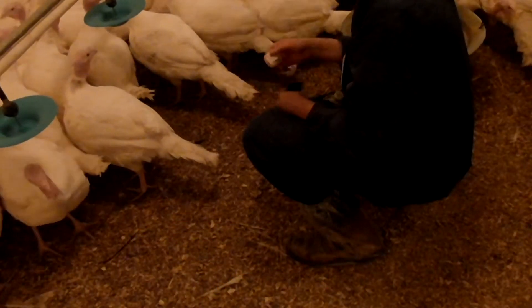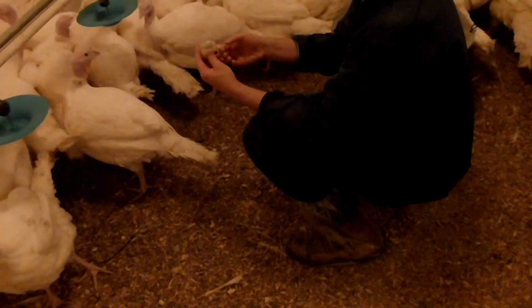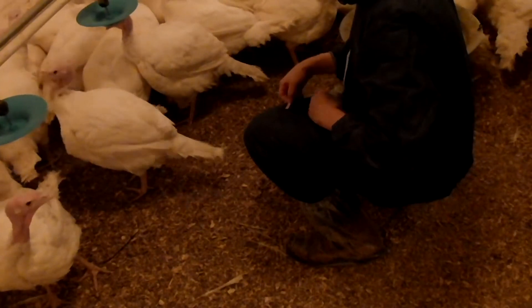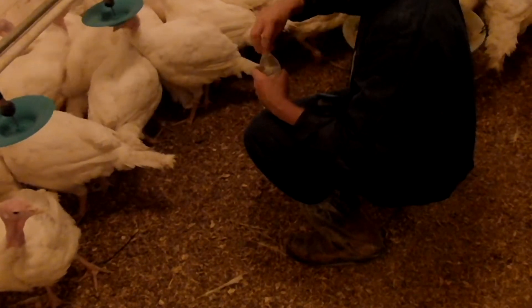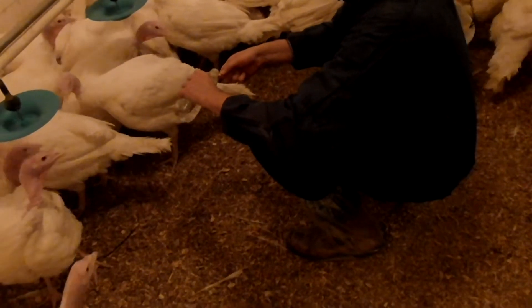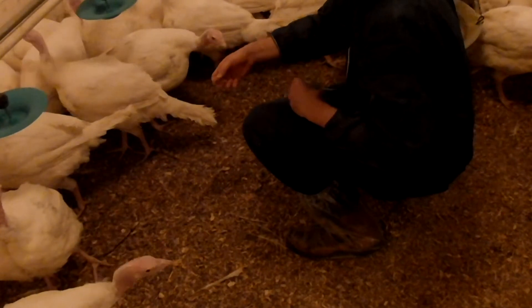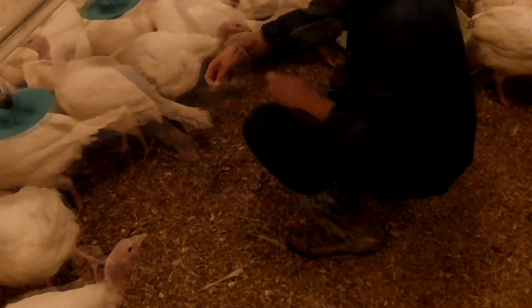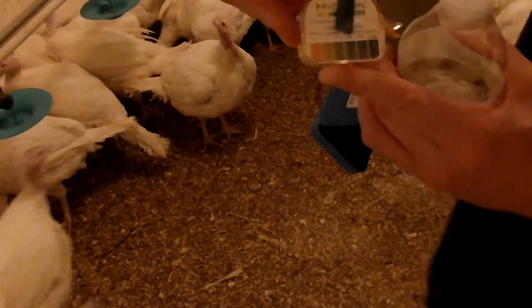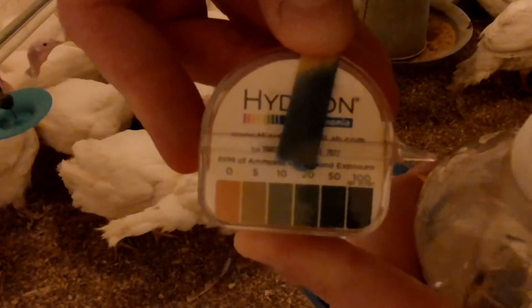Next, a paper test strip was used. A small strip of ammonia test paper was torn from the roll and moistened with water. The test strip was then held at the bird breathing level and exposed to the air for 15 seconds. After 15 seconds of exposure, the color of the test strip was compared to the color scale to determine the measured ammonia gas concentration. It is difficult to see in this video, but the test strip indicated the ammonia concentration was between 10 and 20 parts per million.